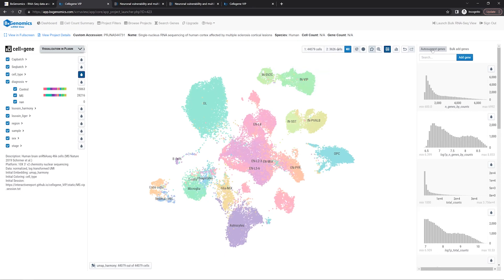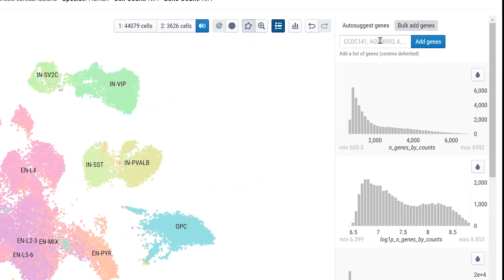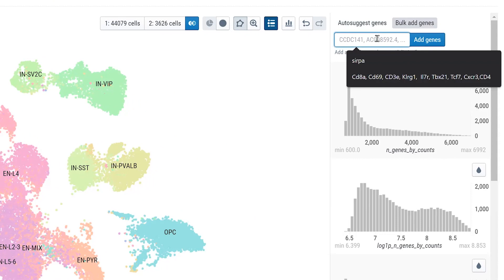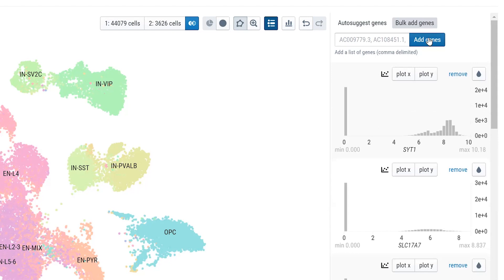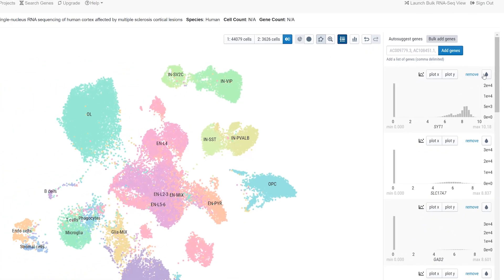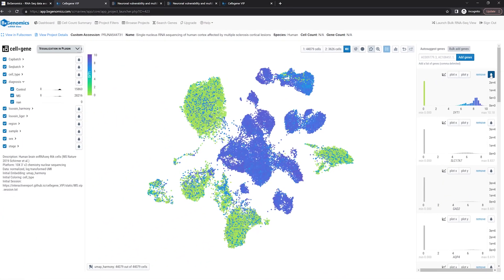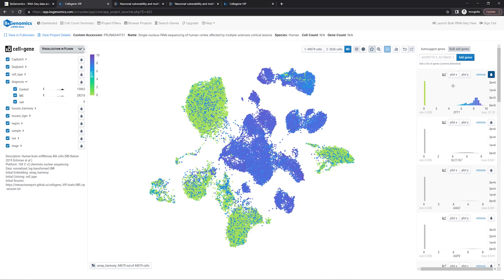Now we're going to check a few marker genes. Just enter the gene symbols into the box under BULK ADD GENES, and the expression values from these genes will be loaded. The gene expression values can be used as a color scale for the cells. For example, SYT1 is a pan-neuron marker — it is highly expressed in all neurons.